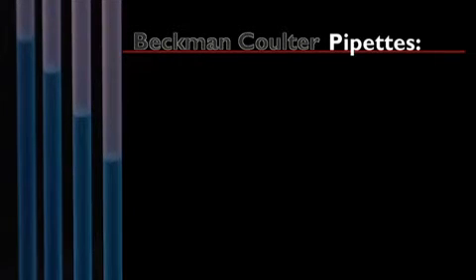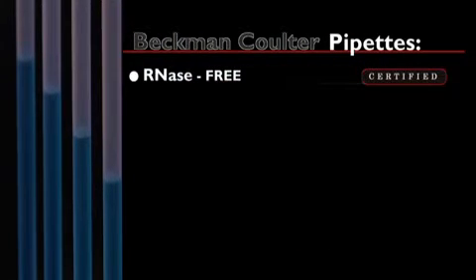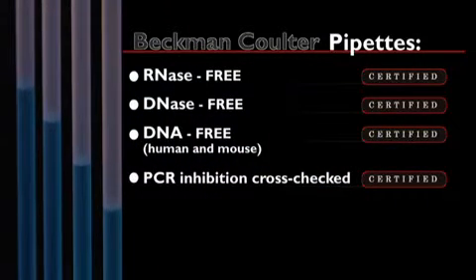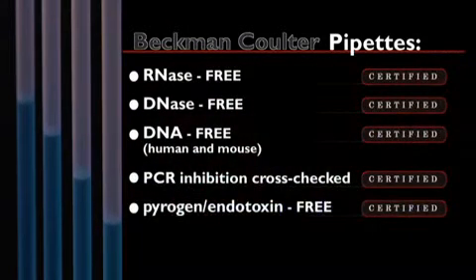All Beckman Coulter pipette tips are certified to be free of RNase, DNase, DNA both human and mouse, pyrogen, endotoxin, and trace metals.